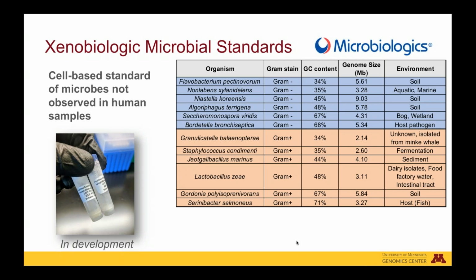In addition, shotgun metagenomic sequencing is increasingly being employed to replace or augment 16S sequencing. And 16S typically offers only genus-level taxonomic resolution, and because it relies on primer-based amplification of the target region, it can introduce further bias.